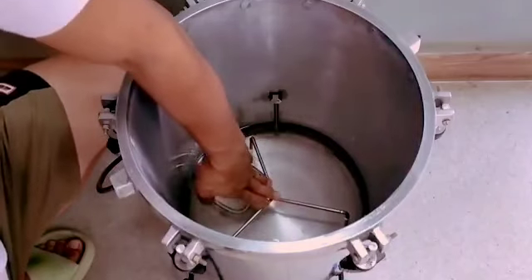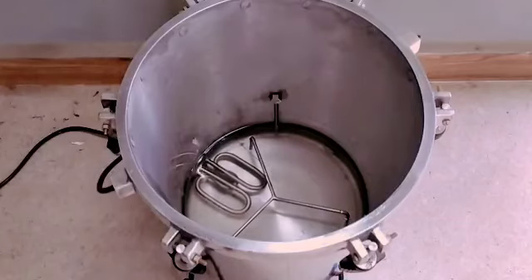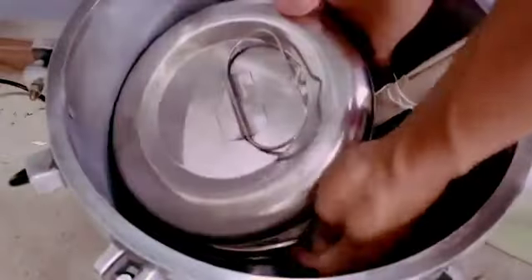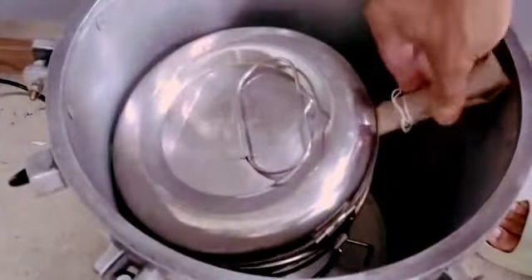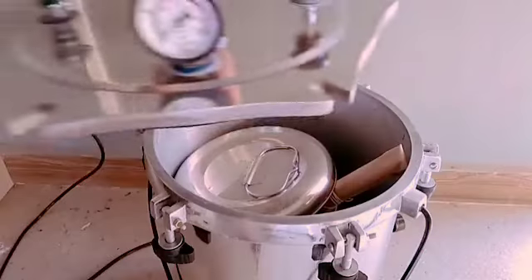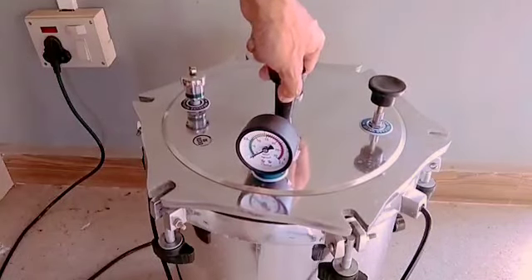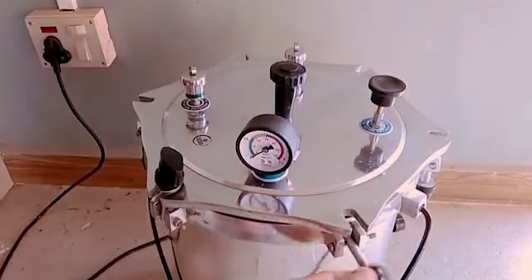Fill the autoclave to the point where the immersion heater coil is completely submerged in water, but the top of the tripod stand stays just above the water surface. Now place the loaded tray onto the tripod stand. Cover the autoclave with its lid. Secure the lid using the lid screws.